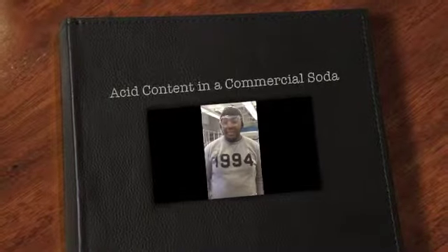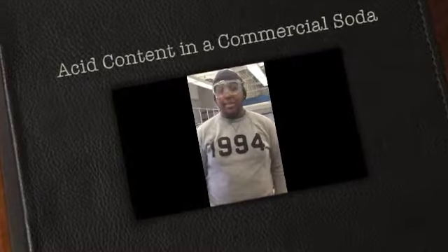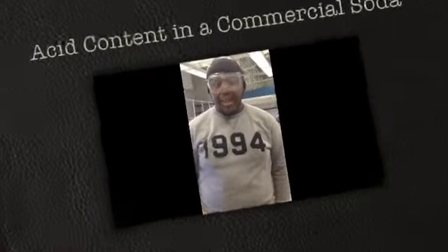Today we're going to be conducting an experiment to find the acid content of commercial soda. A titration is a laboratory procedure for quantitative analysis.